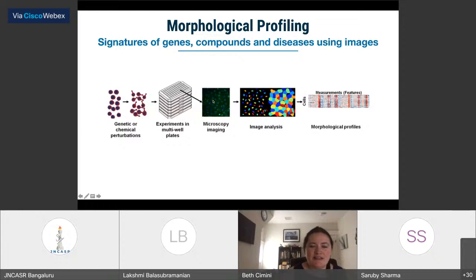This slide implies, because often it's the case where this is done in stacks of multi-well plates with hundreds or thousands, but this approach doesn't need to be used at that scale. We've used this for cases where someone had 4 or 5 different mutants they were interested in looking at. You can use this on a large scale screen, but you don't have to. You can use it on really whatever scale you're happening to work in.